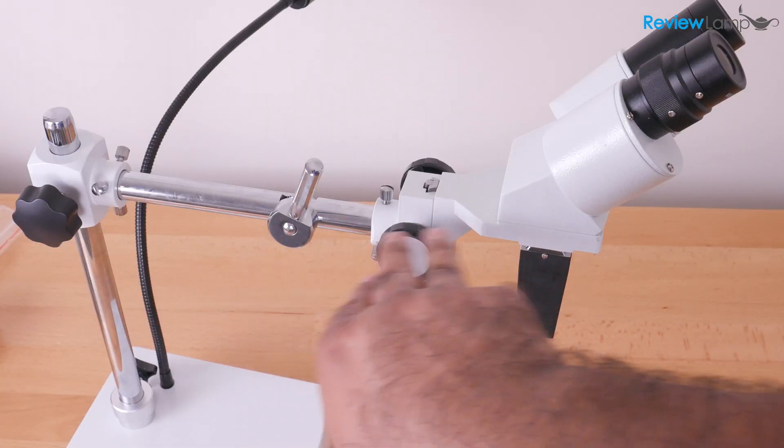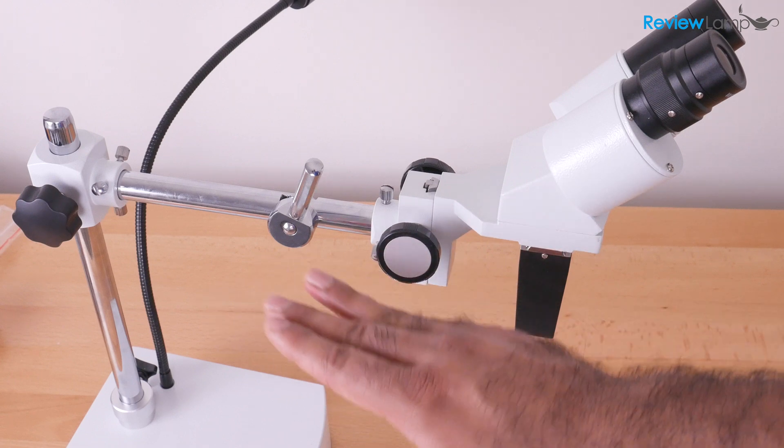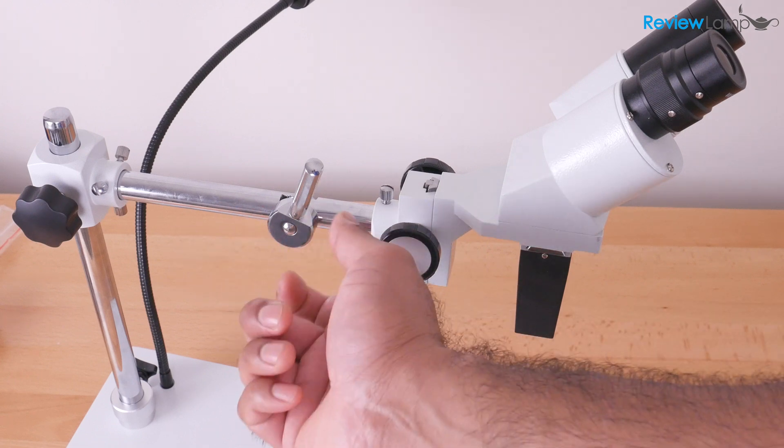Don't worry about the angle in which it's aligned. I recommend just leaving it straight or horizontal for now. And obviously you can adjust it if you'd like by just loosening the handle.